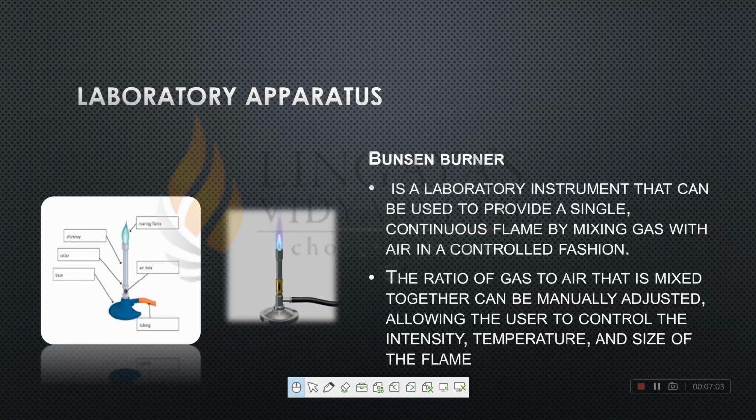Now the next one is the Bunsen burner. Bunsen burner is a laboratory instrument that provides a single continuous flame.